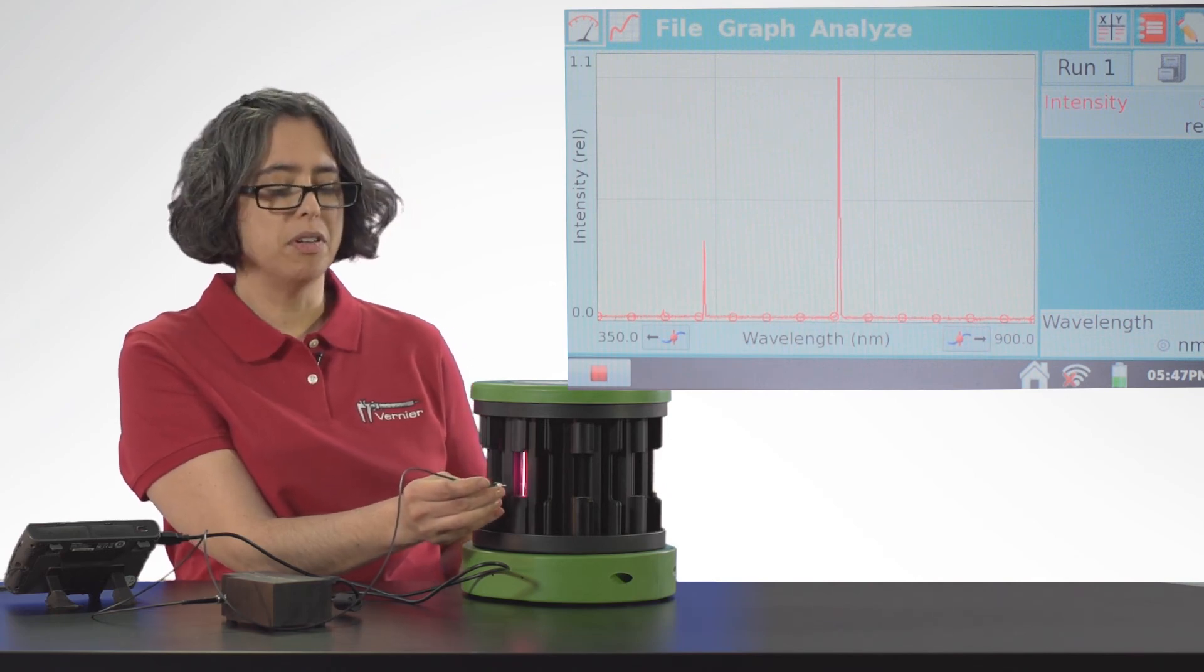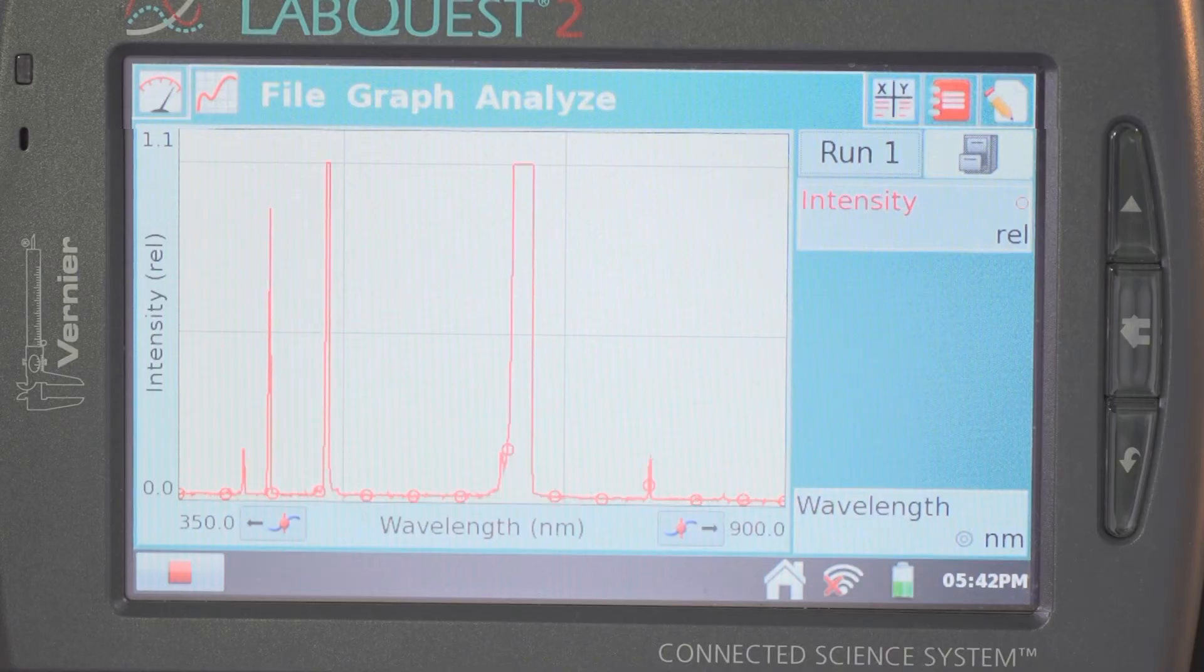I have to move the fiber closer to the spectrum tube to get precise measurements for the less intense shorter wavelength Balmer line emissions.